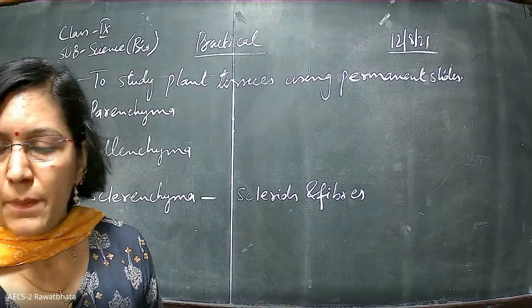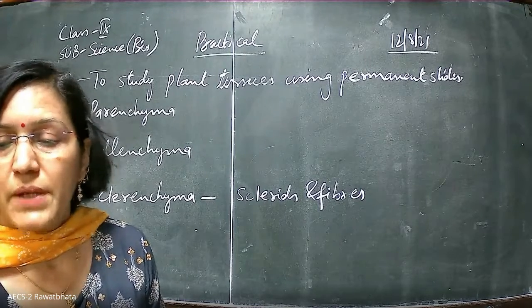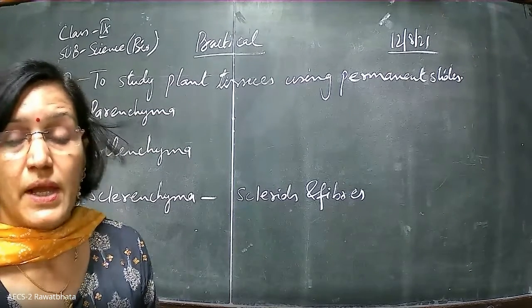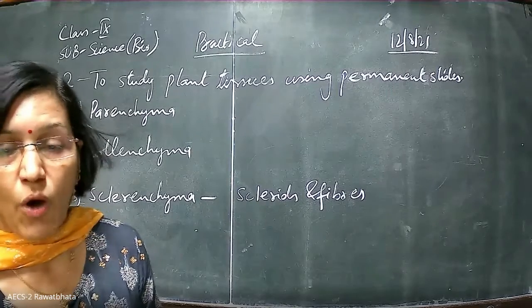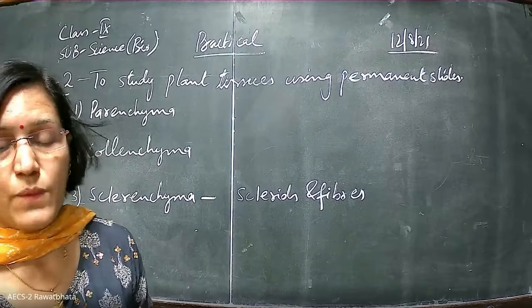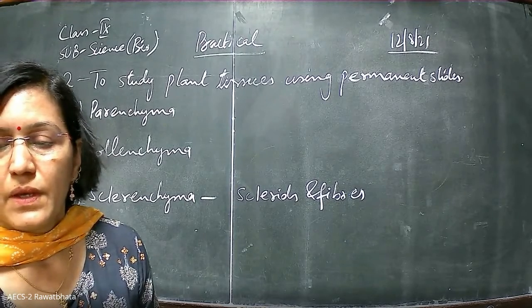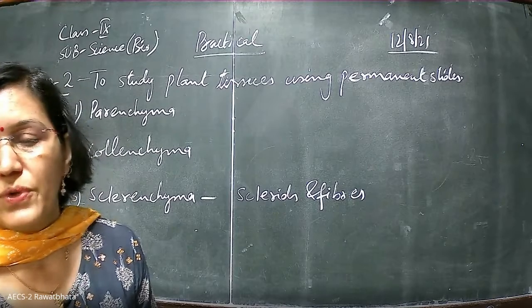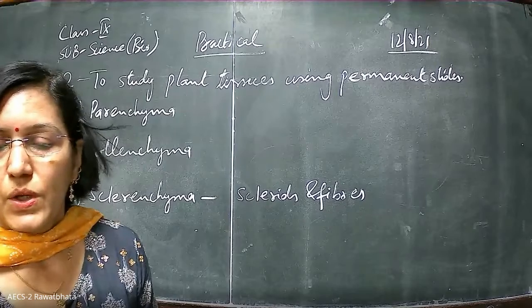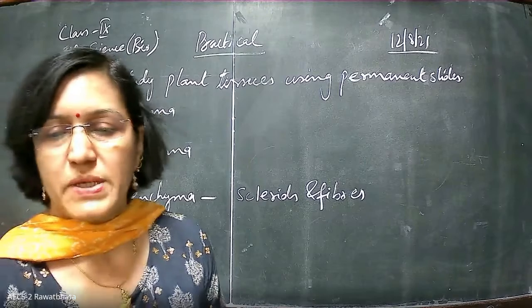Now you can put up in the comment box and tell me, have you seen all the slides very carefully? Is there any confusion in the slides of the plant cells? So that we can move ahead with that of the animal cells. All the slides were clear to all of you? Okay, good. I got your message, kids.